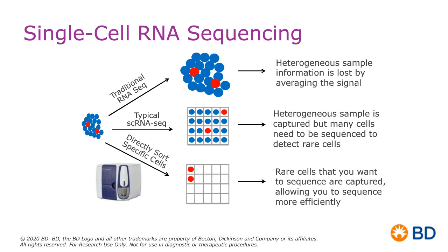Now, that was well and good, but we're often limited by the number of proteins that we look at on the cell surface. And certainly, I know for myself, when I sorted cells, I wasn't interested in just adding more antibodies just because. I was just interested in adding what I needed to get the cells I needed into the individual wells. So your protein was very limited in terms of the information that you could get. So there's need for an improvement of technologies.